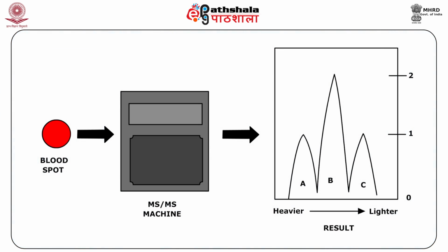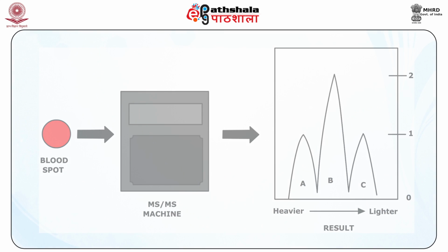Note the figure in which the blood from a newborn can be screened for sickle cell hemoglobin or any other molecular variant of the normal hemoglobin within minutes, just using a drop of blood. This could be important information for the neonatologist in the course of treatment to be followed.